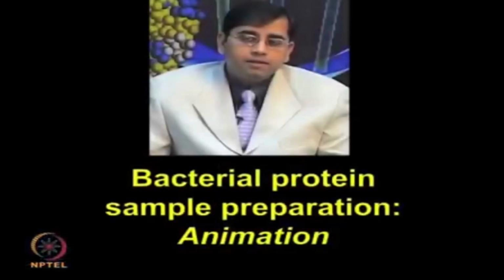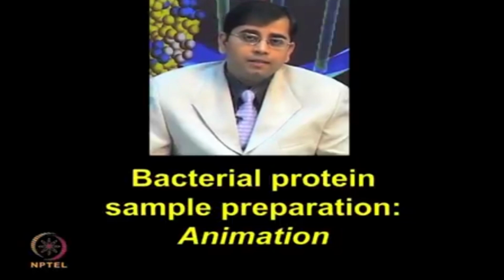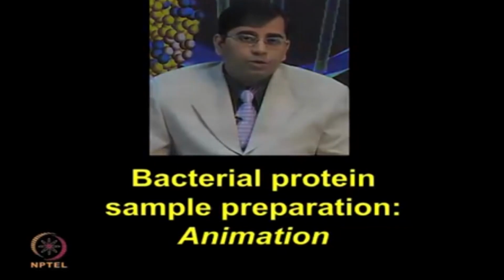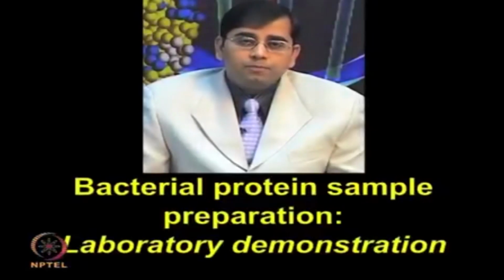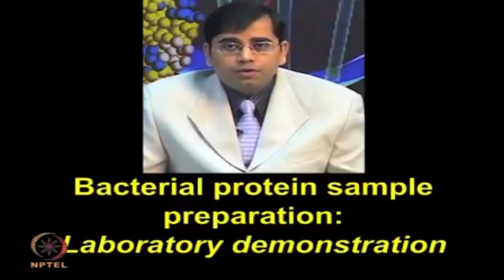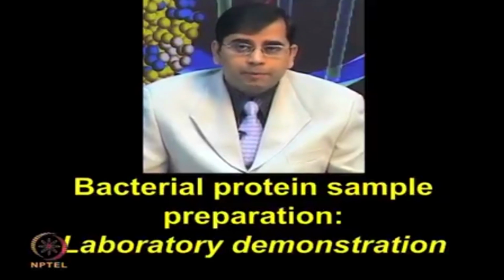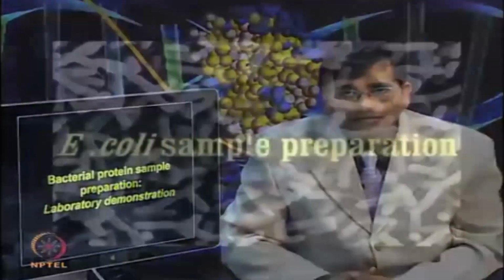Bacterial protein extraction by using trizol method, and you must appreciate that in this method you can obtain RNA, DNA and protein, all the biomolecules together. So, to give you further information about the detailed protocol as well as how to perform these experiments in the lab, I will show you a video for the laboratory demonstration of bacterial protein sample preparation for proteomics applications. So, let us watch this video.